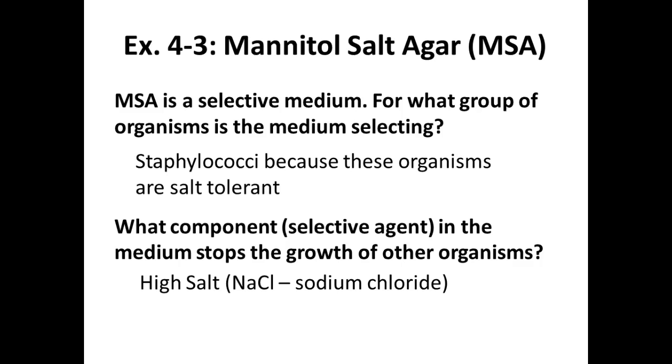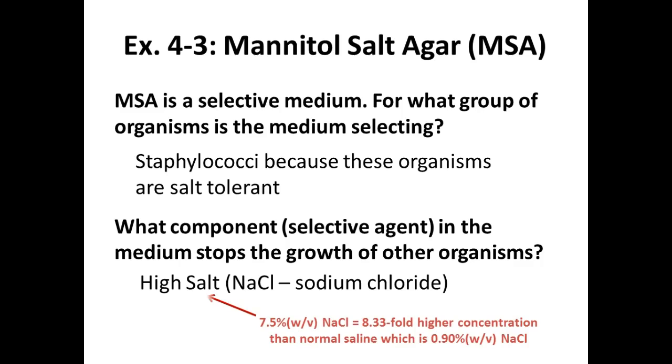But it's not just the presence of salt, because all media for the most part is going to have salt. It's the fact that it's a high concentration of salt. So it's 7.5%. This is 8-fold higher than normal saline, right? That's isotonic solution of 0.9%. Right, so this is a very high salt concentration.